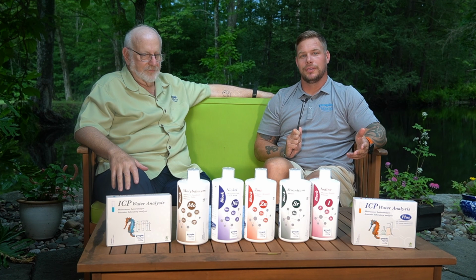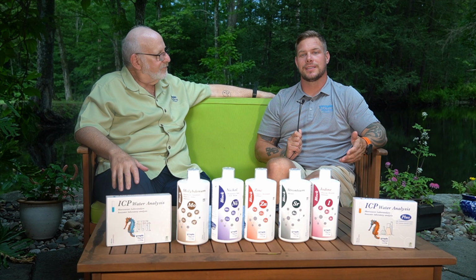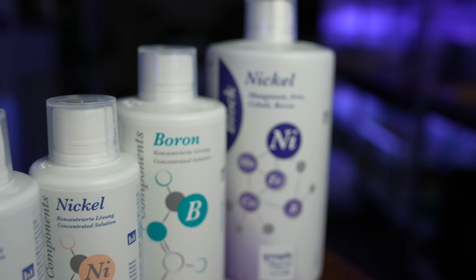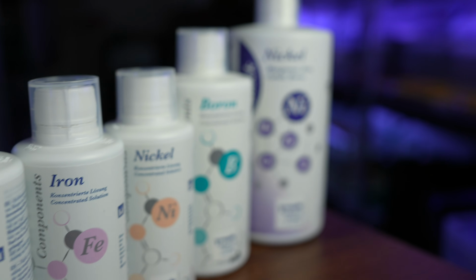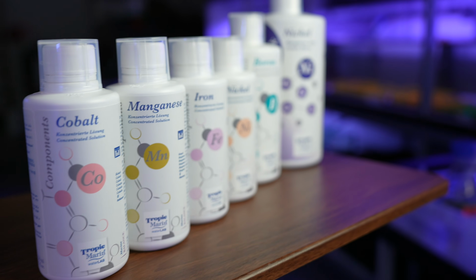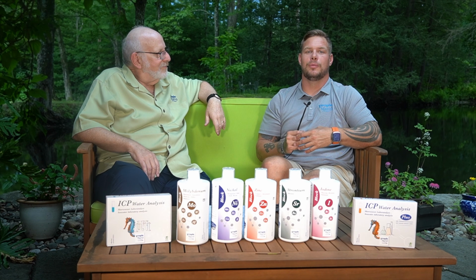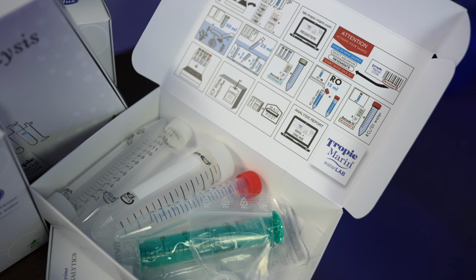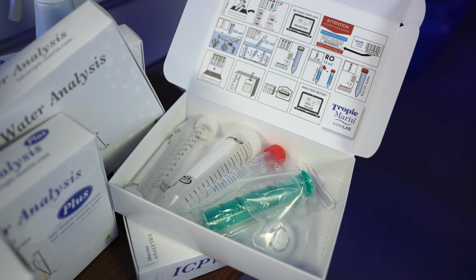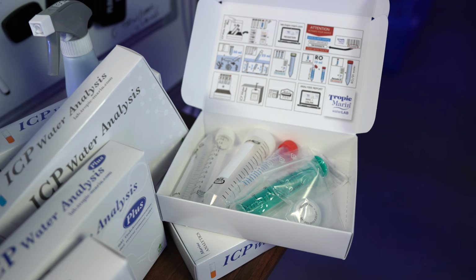So one example that's fairly easy for us to test with the ICP OES is nickel and the elements that are in the same family as nickel. So for example, you have manganese, iron, cobalt, and boron. These elements are going to deplete in a specific ratio, as nickel will. The indicator element is nickel. When you get your Tropic Marin ICP results back, you're going to see that if your nickel is depleted in that family, they're going to tell you how much of that nickel block to dose.